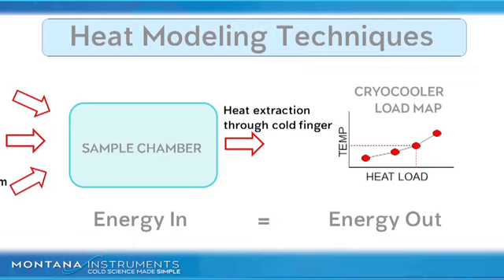We can calculate, for example, if we put 50 milliwatts into an RF cable, what the temperature response will be. Or if we add another 36 gauge wire, what the base temperature will change to. Similarly, it can help us identify problems. If we calculate all the loads of the system to be much less than this value, we can start to track down where the problem might be. For example, a wire in the cold space that unexpectedly touches a shield at a higher temperature will result in a heat loss.